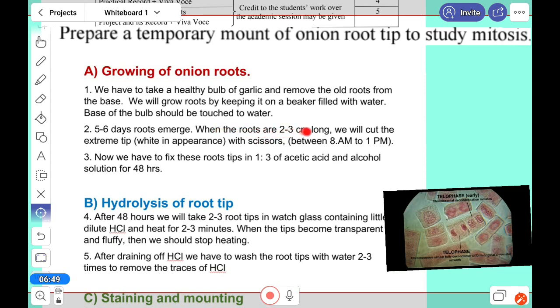When the root is two to three centimeters long, then we will take it out. An extreme tip, that means one centimeter from the tip, with scissors we'll cut it, and it should be between 8 a.m. to 1 p.m., the morning time. Now next, we will fix it in one is to three acetic acid and alcohol.